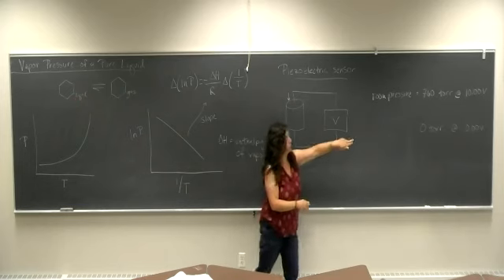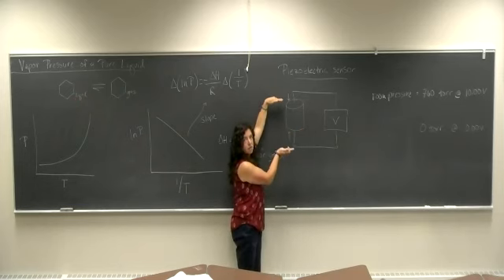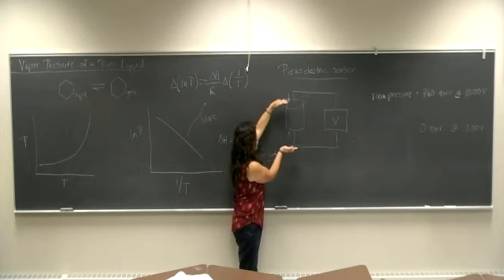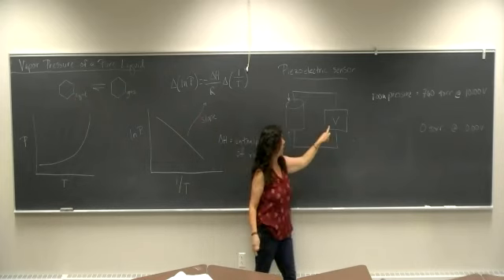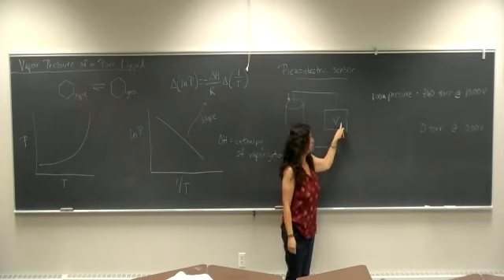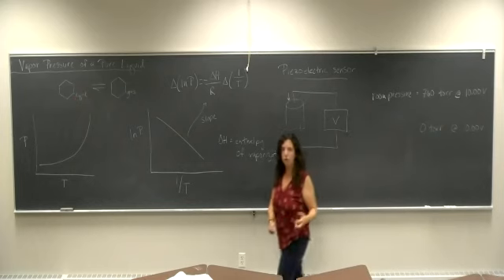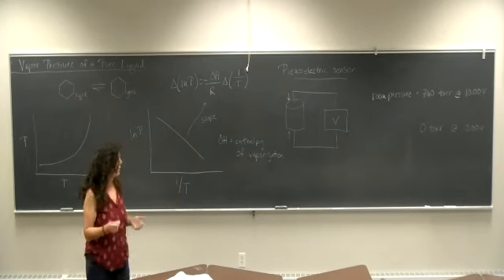And so we'll go from 0 voltage to, as the pressure of cyclohexane increases as it converts to a gas, we'll have some stress on the sensor, which will then increase the voltage. And again, once we get up to our 10 volts again, we should see the increase there.